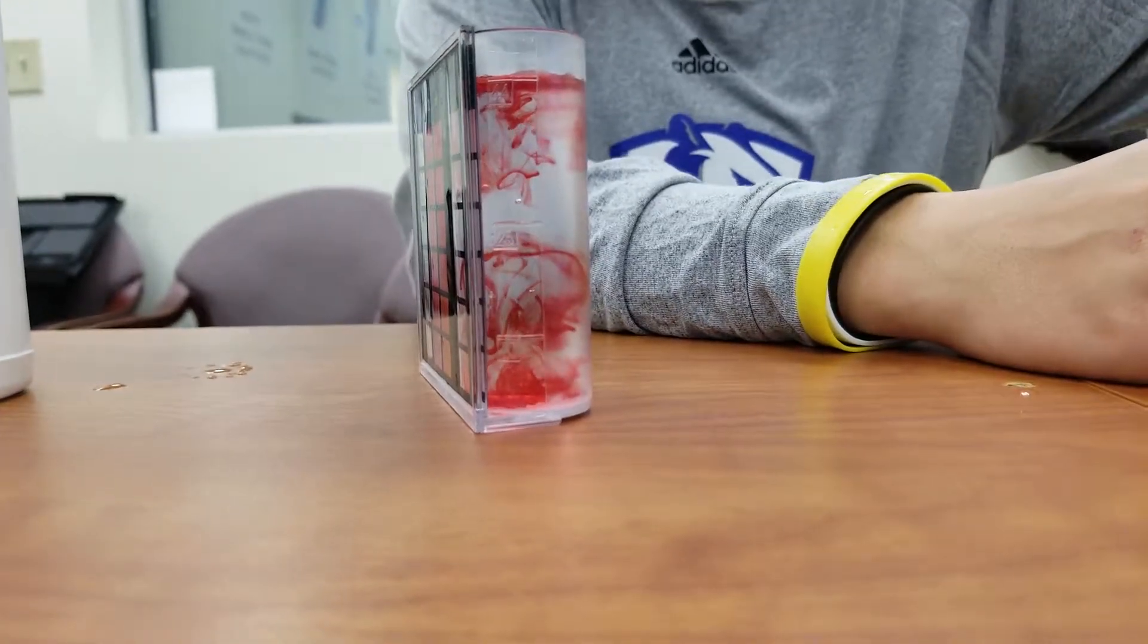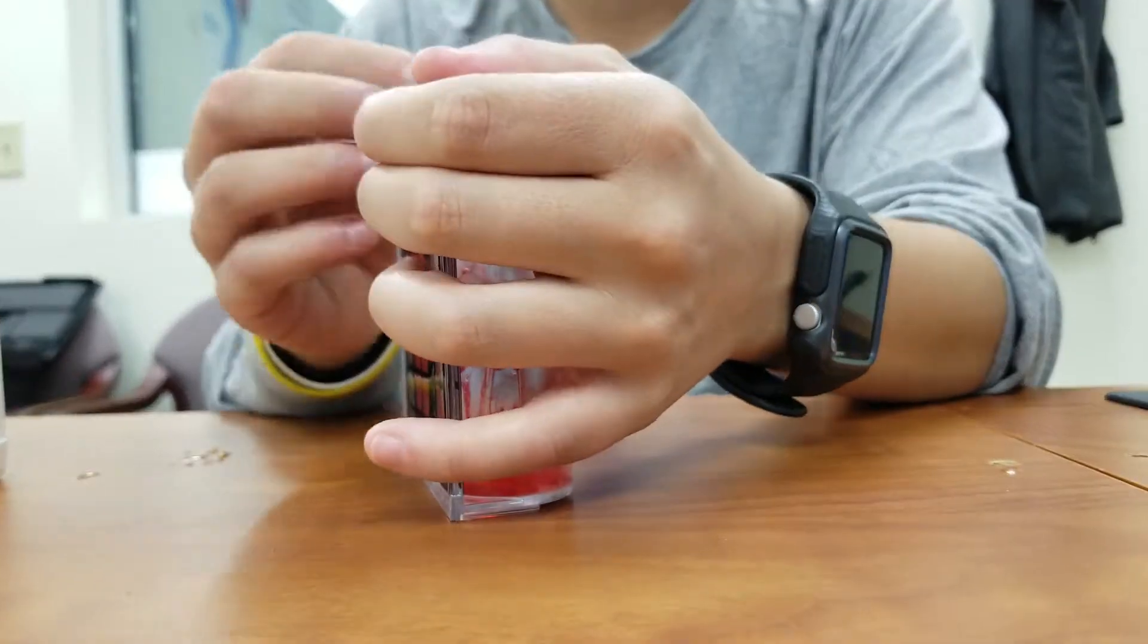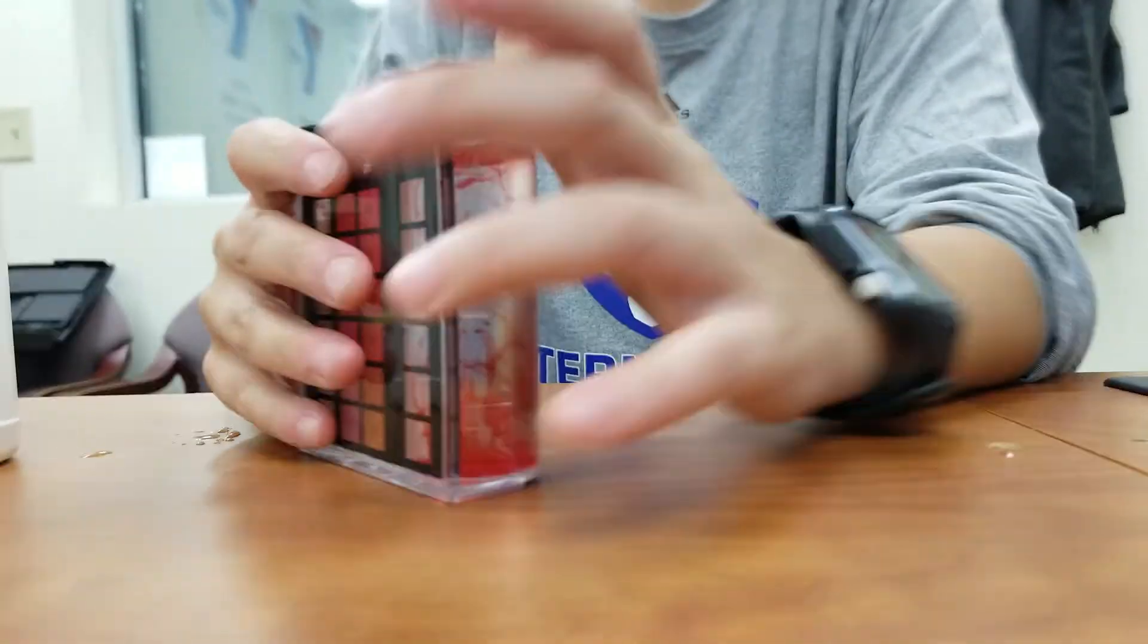The reason it messes it up is because it creates a larger surface tension, so a larger drop goes in instead of standard drops.